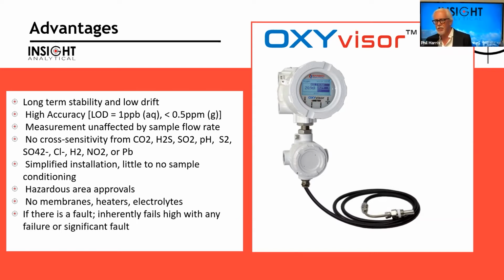The probe is detecting the partial pressure, and even when we consider an aqueous system, it's really the dissolved pressure, the partial pressure of the oxygen in the aqueous phase. And so it's not affected by flow rates. We can have a lot of flow rate variability, and it's not going to affect the readings on this device. It has no cross sensitivity from a lot of the things that may be in some of our samples.